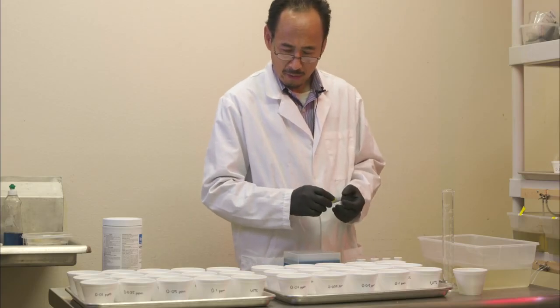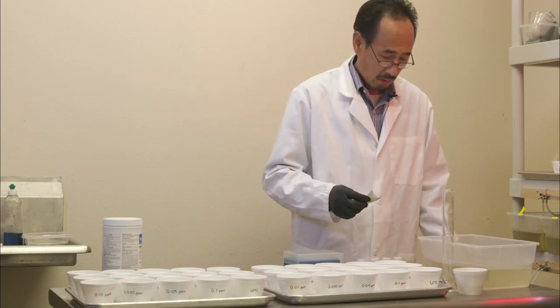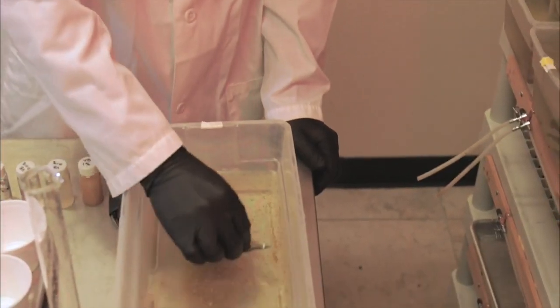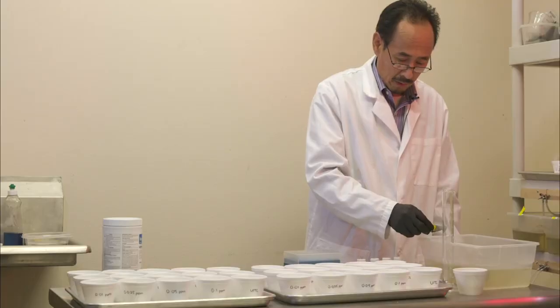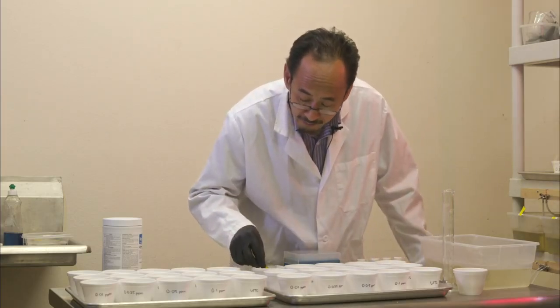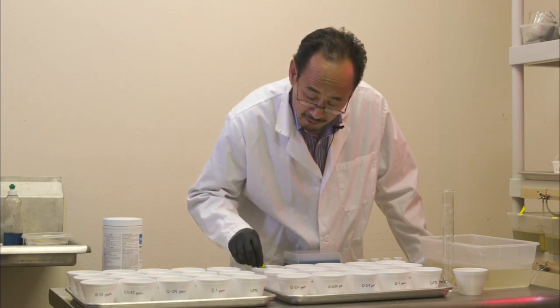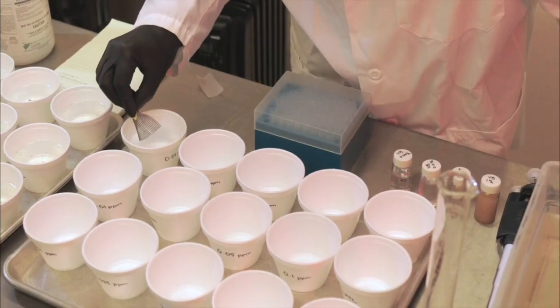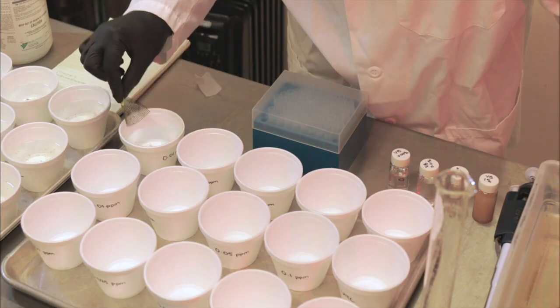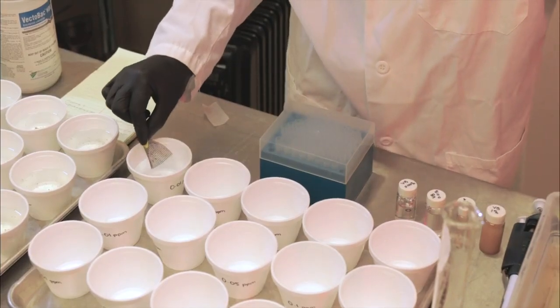For BTI test, as we know, BTI is very quick acting material. So we use early 4th instar, or late 3rd to early 4th, it'll be okay. So we recommend to use a screen. The advantage with the screen is you don't traumatize the larvae. You just touch the water surface, let the larvae swim away. At the same time, you can count, inoculate 25 larvae per 100 ml water. You can control the pace they will swim away from to get it done.